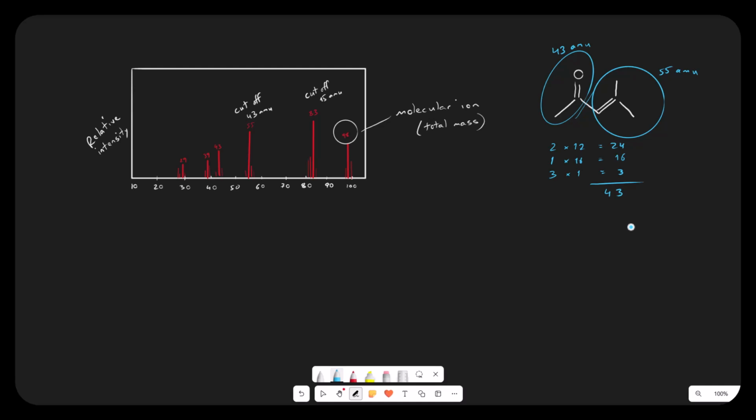It's really, really powerful when you've got the equivalent of a word bank, right? When you've got, I know it's one of these 5 things, I know it's one of these 30 molecules, let me run this mass spec, and then you can look and see, oh yeah, this is consistent with this, this is consistent with that. You can identify quite a bit from that.